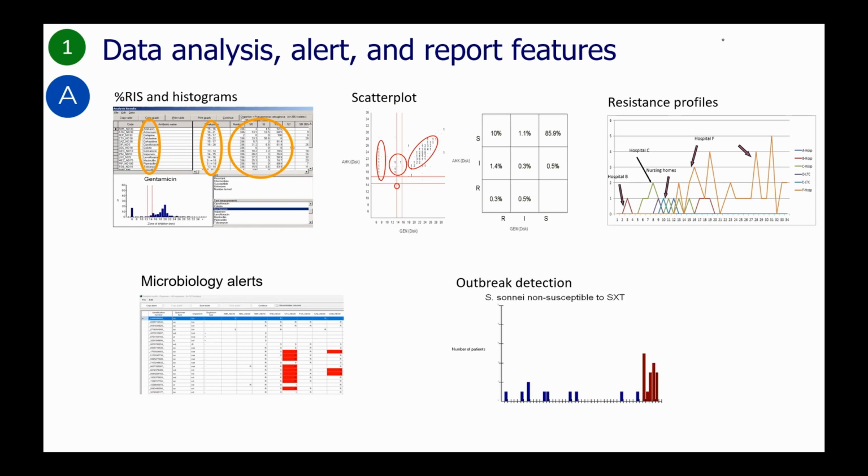The figure in the bottom left illustrates the use of microbiology alerts shown in red to notify laboratory and infectious disease staff for results of public health or clinical importance, as well as infrequent and unlikely findings, which may suggest an error in test performance.